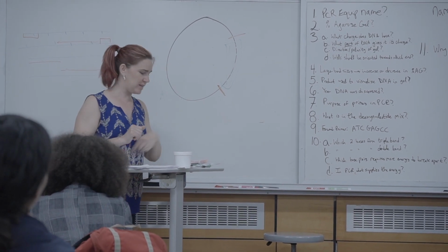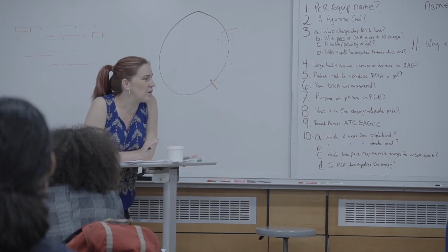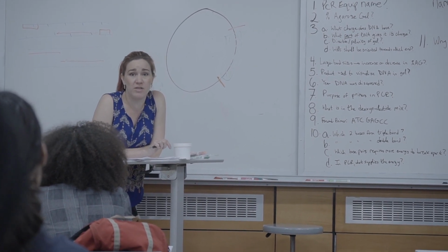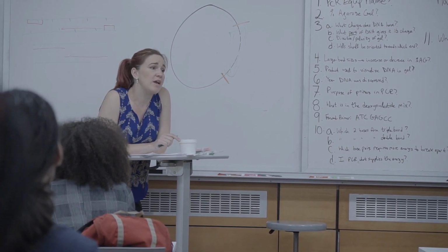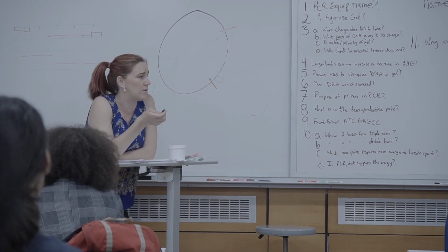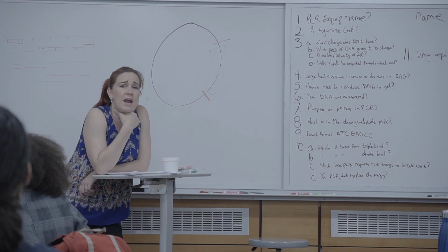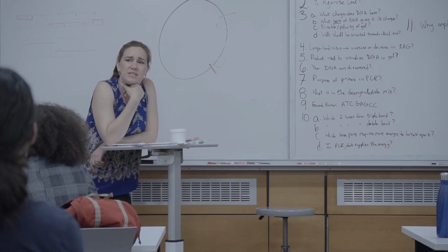What product did we use to visualize the DNA in our gel? So what was the one we put in the gel that would stick to DNA? SYBR Safe, right. But I understand why you'd say blue juice, because to see our reaction running down the lanes, we use the blue juice. So that works too. But the SYBR Safe is the key part. If we only had blue juice in there and no SYBR Safe, when we put it on the UV, would you have been able to see the DNA?